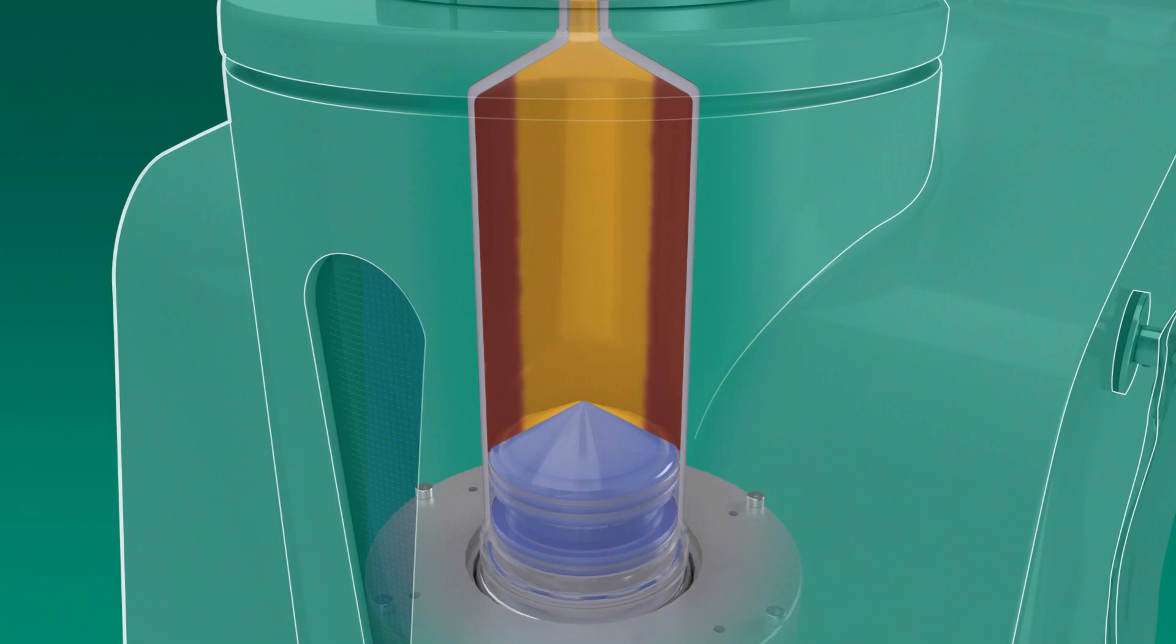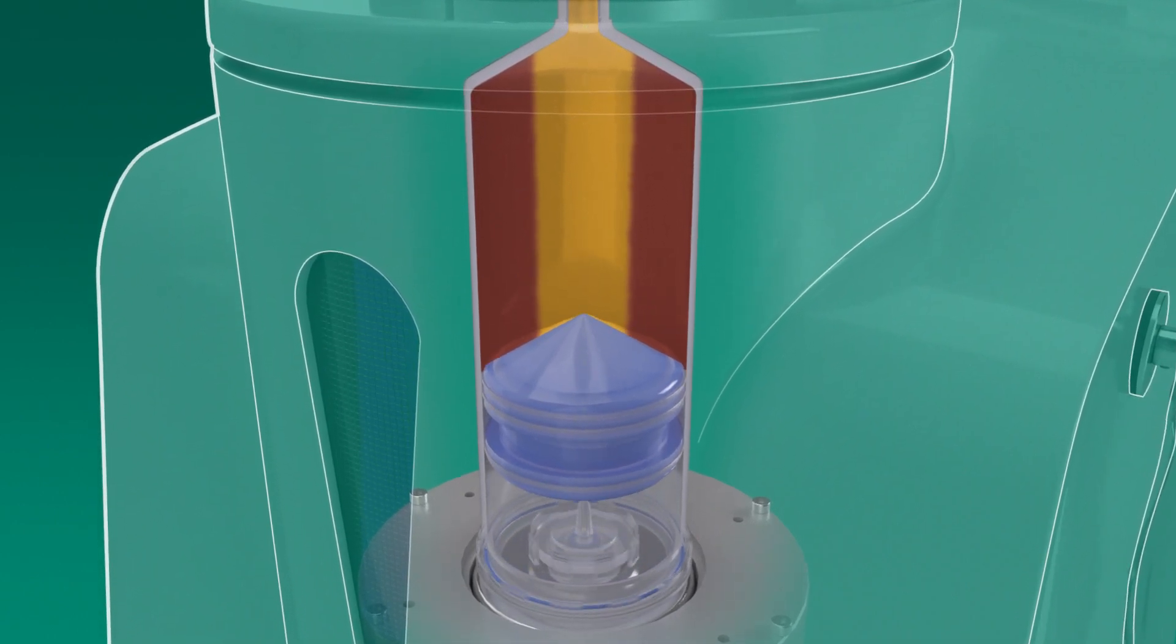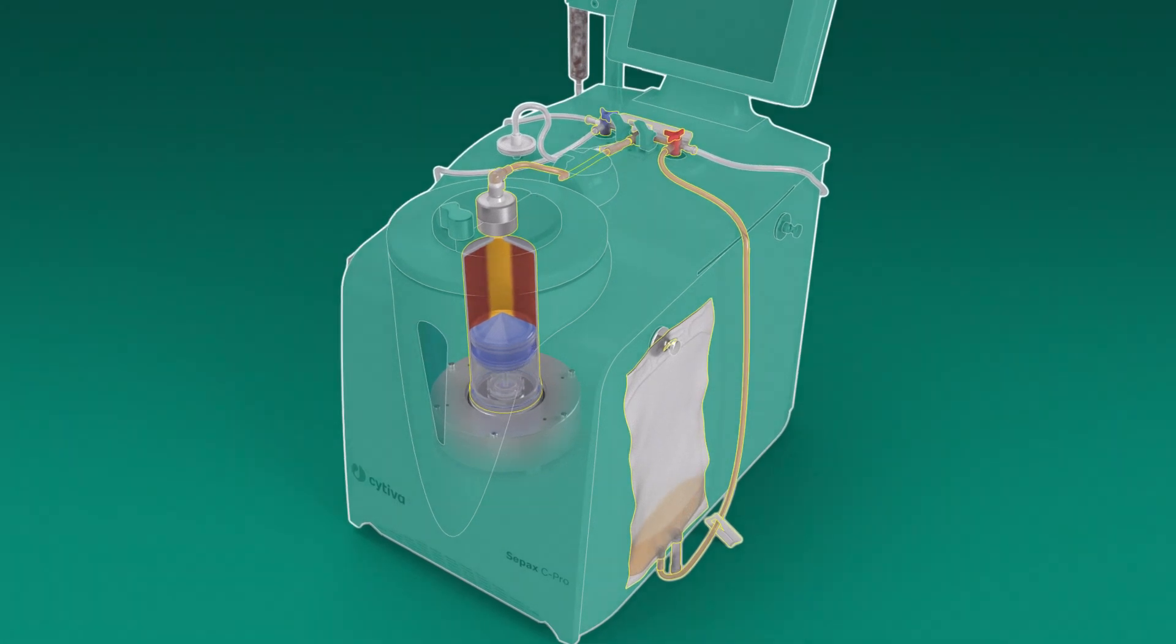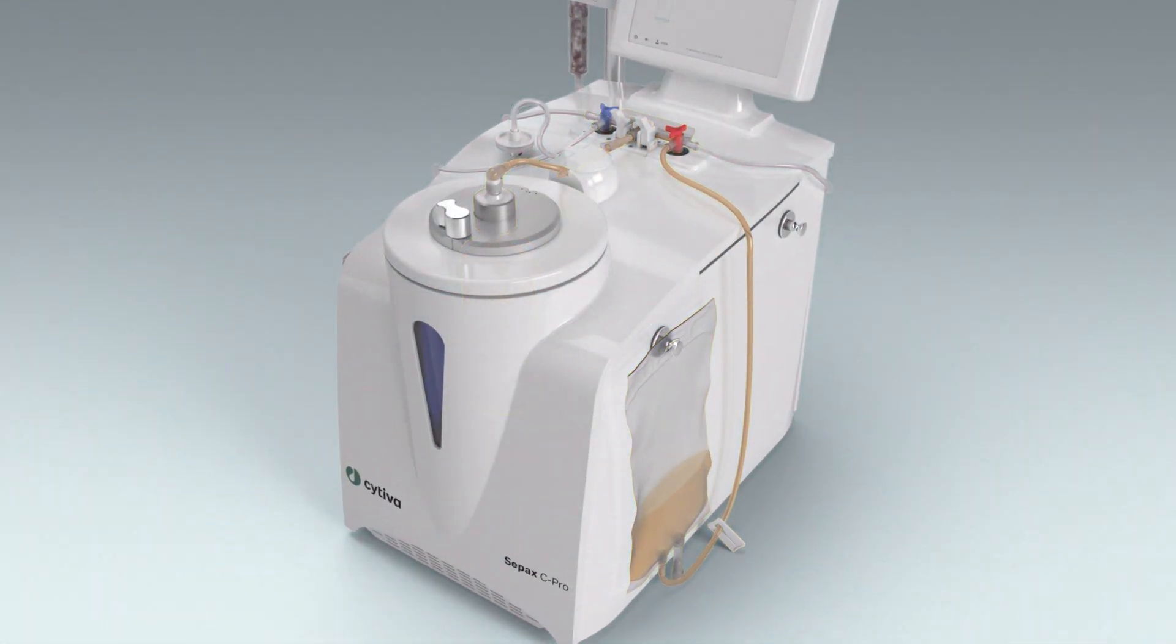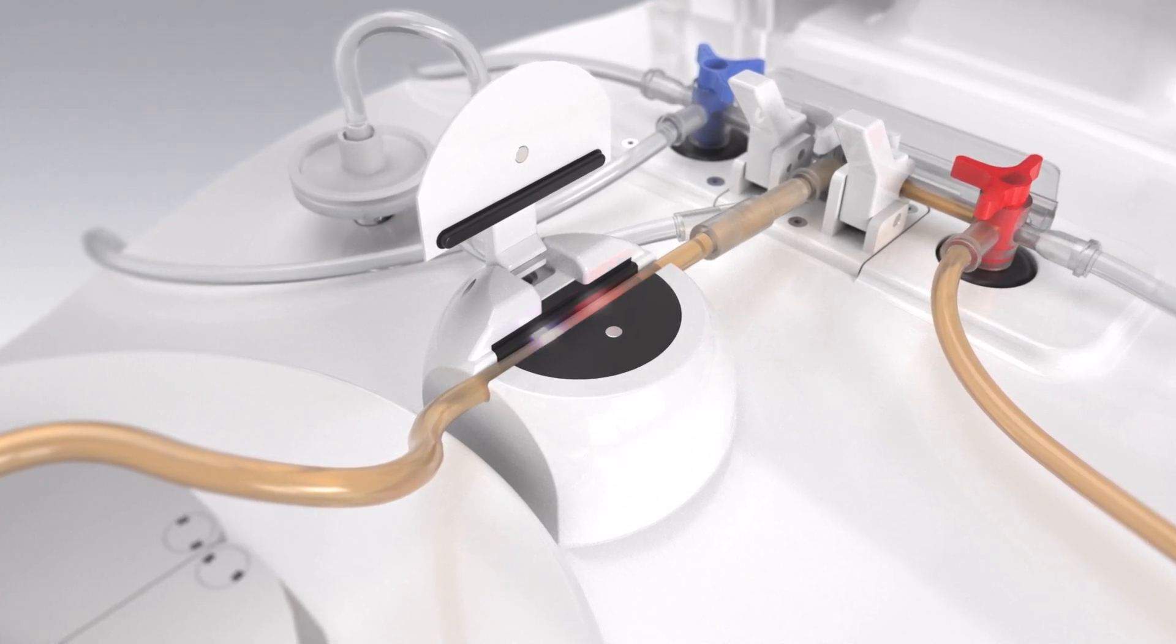The supernatant located along the spinning axis of the separation chamber is the first product extracted into the waste bag. The optical sensor detects what passes the optical line to monitor the process.